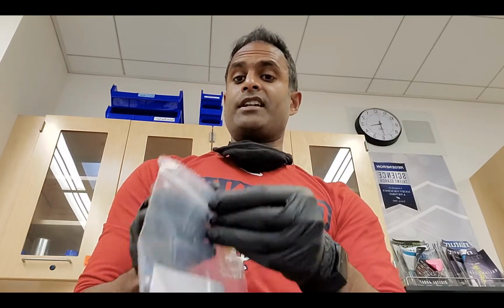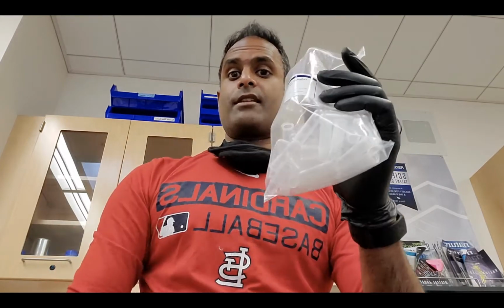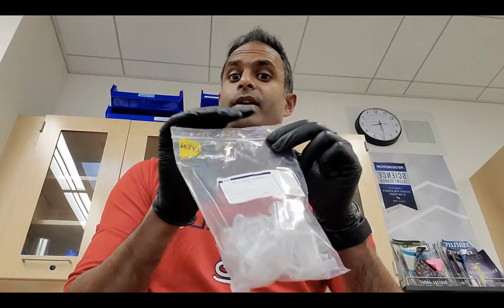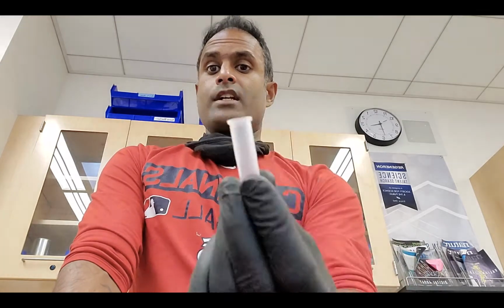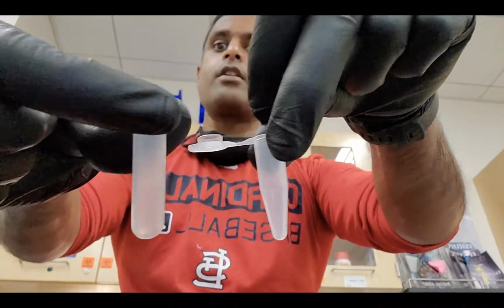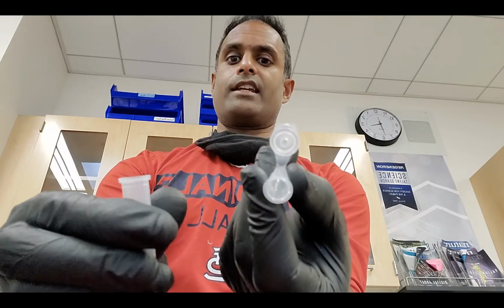So I'm going to take a collection tube out of this bag, but I never reach into the bag. What I'm going to actually do is shake a tube out, and that's because I just don't want to screw up anybody else's research. I don't know how important it's going to be if they're going to use these tubes in the future. I know my area is clean, so now I have a collection tube. So take a look at the difference between the two tubes. First, one has a round bottom, one has a pointed bottom, and then obviously one has a lid and the other one does not.